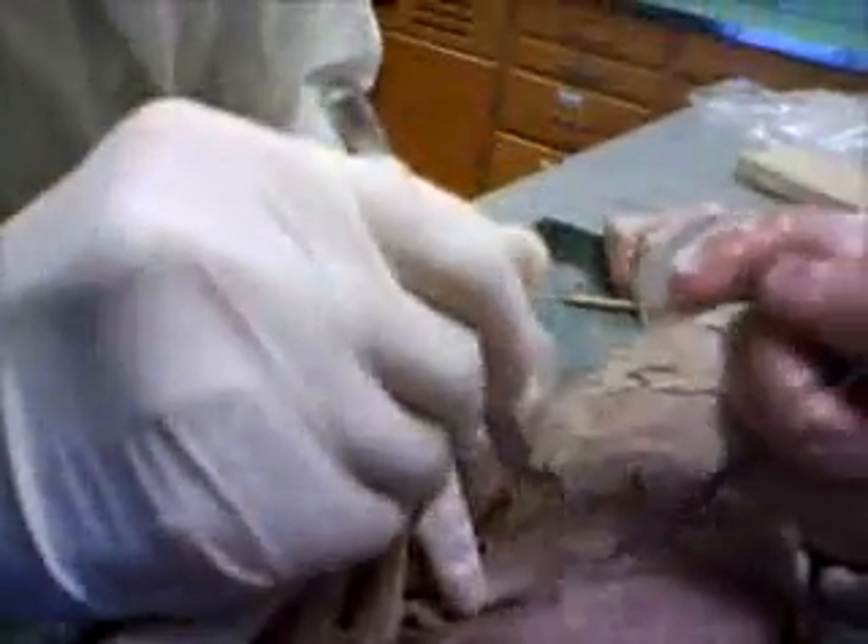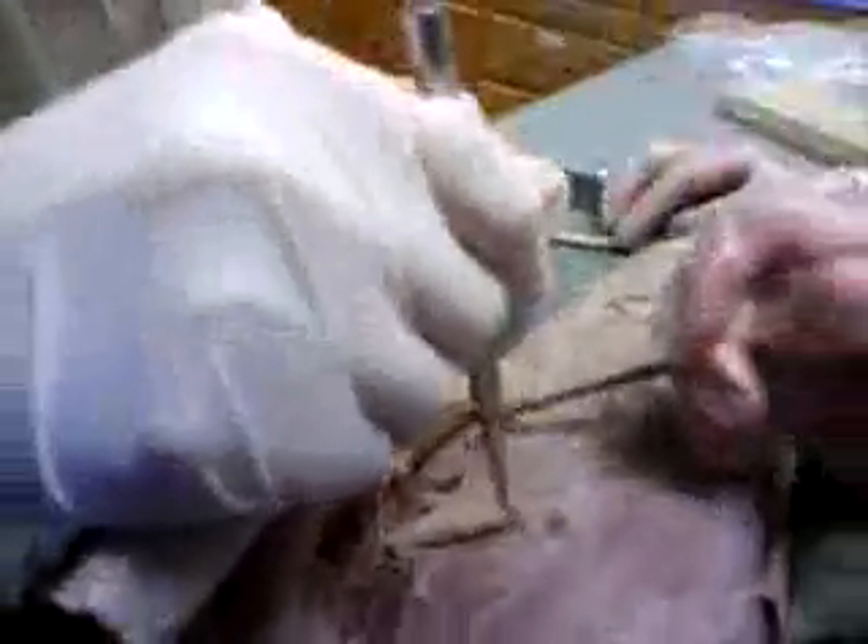You hear that, kids? Don't do drugs. As you can see, Tracy is inserting her probe into the hole in the cat — very deeply and slowly, tenderly. Penetration of the hole.